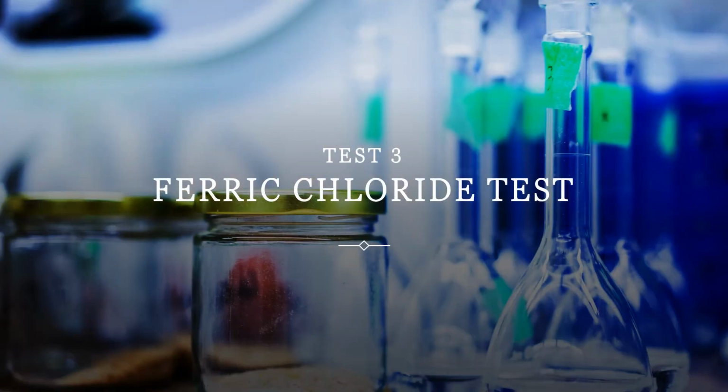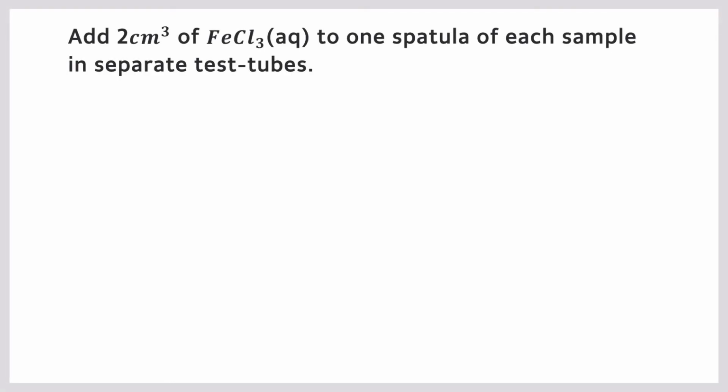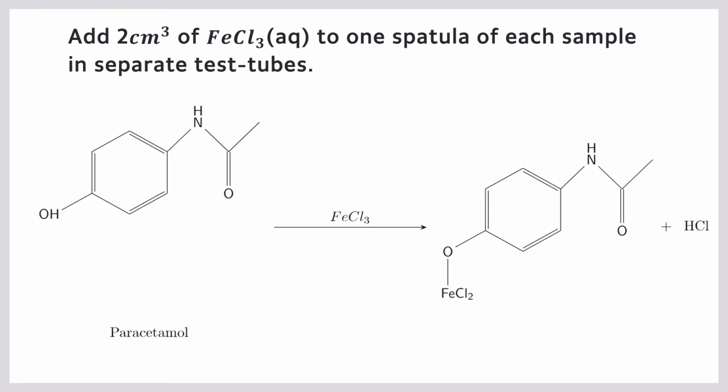From there, we conduct our last test, which is the ferric chloride test. This test is actually in chapter 4, so this has been recently introduced to us, and hence it may be a bit unclear as to how it works. So basically, what we do is we add 2 cm cube of aqueous ferric chloride, which is iron(III) chloride, to one spatula of each sample in separate test tubes. From there, we are able to observe this result in paracetamol, which has a phenol group which can react with the ferric chloride to form this violet complex and hydrochloric acid.